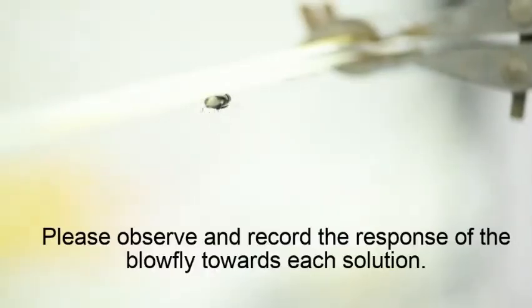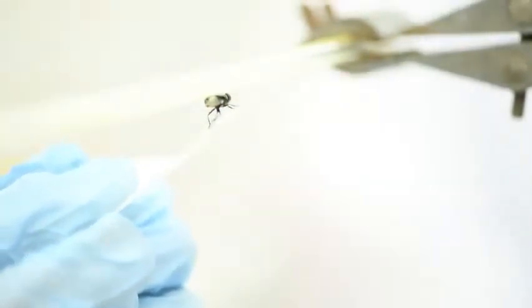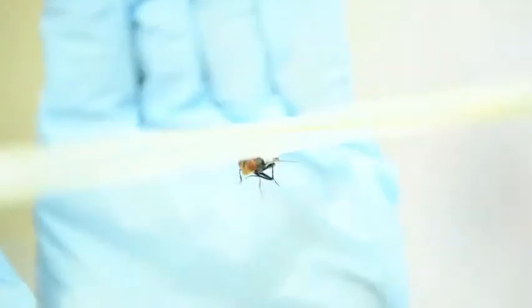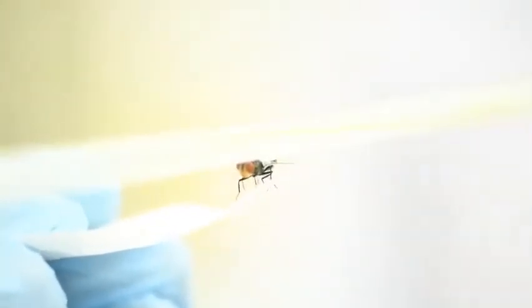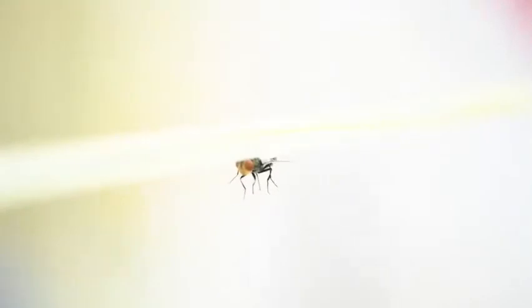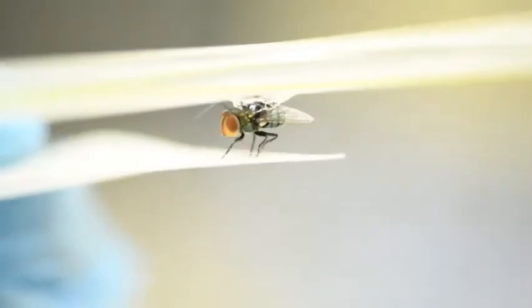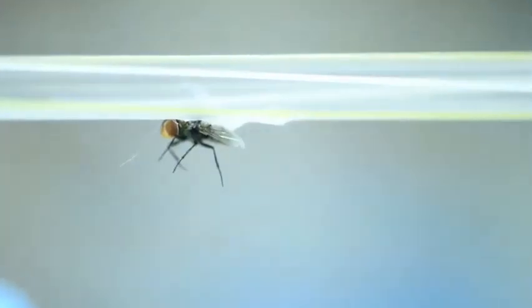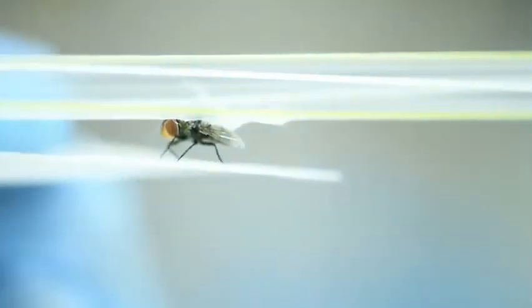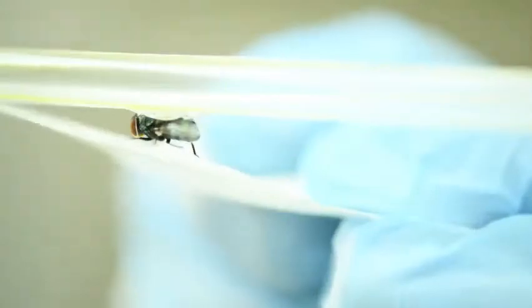First solution, distilled water, individual 1. Second individual, third individual, fourth individual, individual 5.